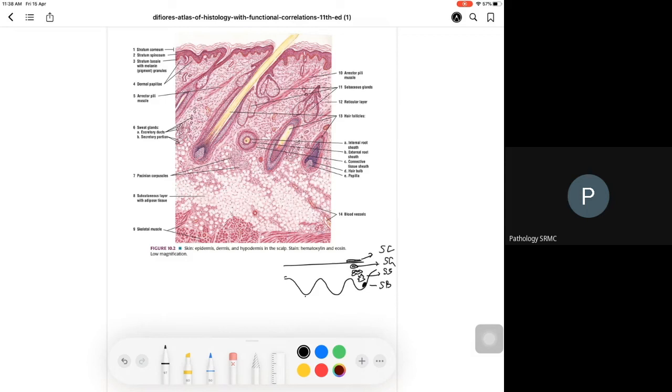They talked about melanocytes, and when you enlarge this area, the junction, you will see the basal cells, and in between the basal cells you see large cells with somewhat vacuolated cytoplasm. One thing you have to remember, even though we call them melanocytes and they produce melanin, the minute they produce melanin, they will export that melanin to the basal cells.